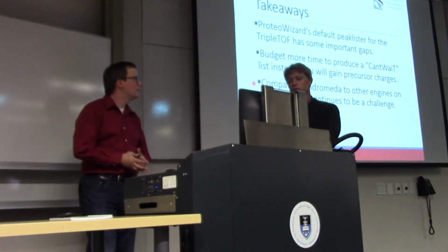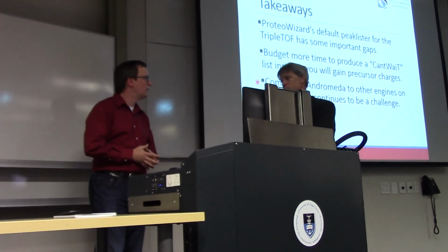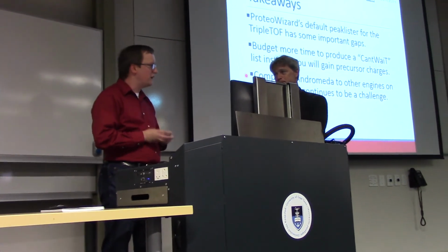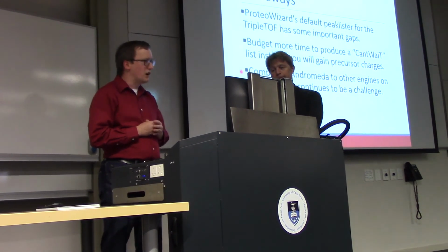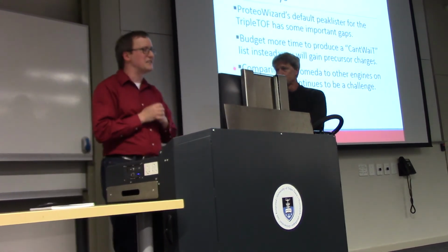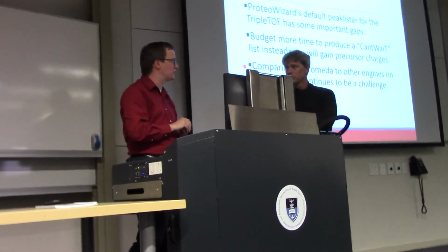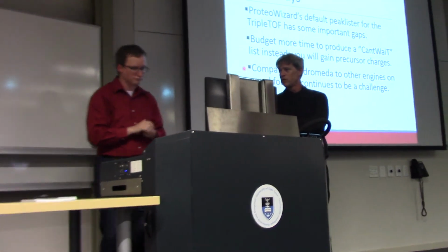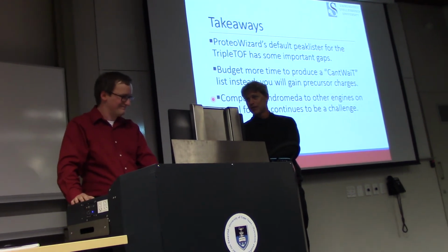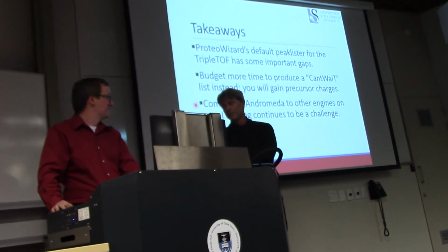What about instead taking the other approach to build better algorithms to predict the theoretical spectrum for every single peptide? I have been really surprised by the degree to which proteome informaticists are not interested in that problem. There are a few groups that have worked in predicting fragments from peptides, but it's a surprisingly small number, and I haven't seen people interested in that bent looking in the TripleTOF direction yet. Because that seems the obvious solution to this problem, actually. If you can use robust intensity predictors, not just fragmentation predictors, then you don't need to have observed the spectrum before. You can create your own in silico spectral library. Yes. For stuff you've never seen before.